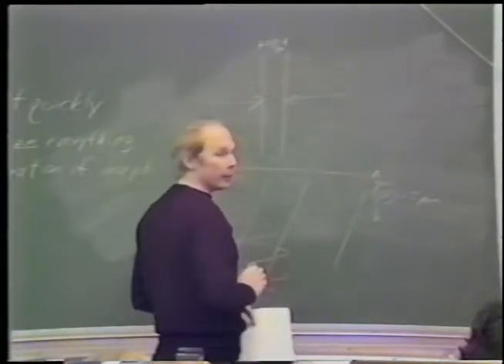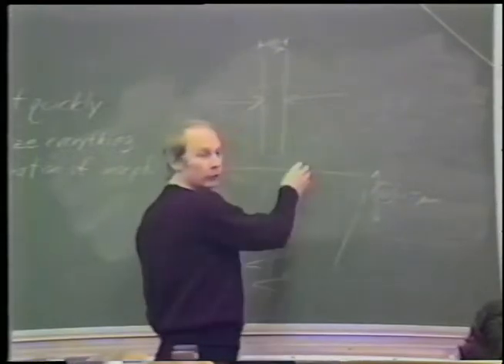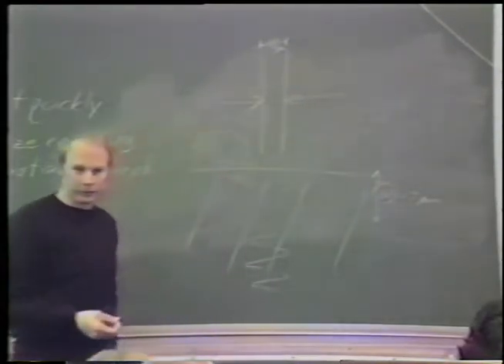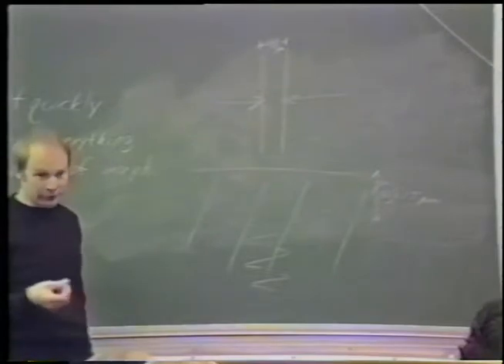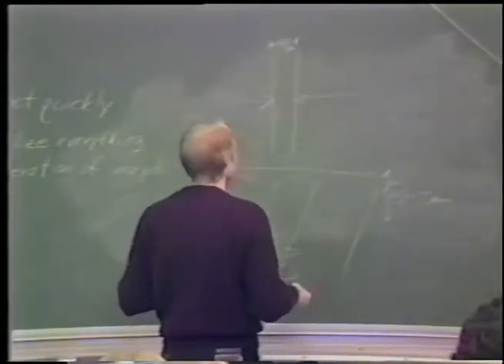This is predicted theoretically, and it's observed experimentally. You can get 4 times the depth of one-sided freezing in a sample cooled from both sides under optimal conditions. Okay?